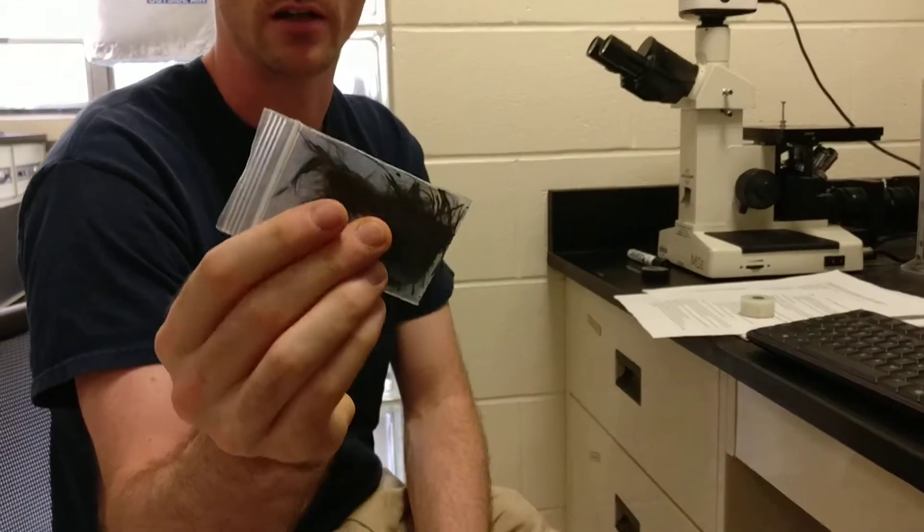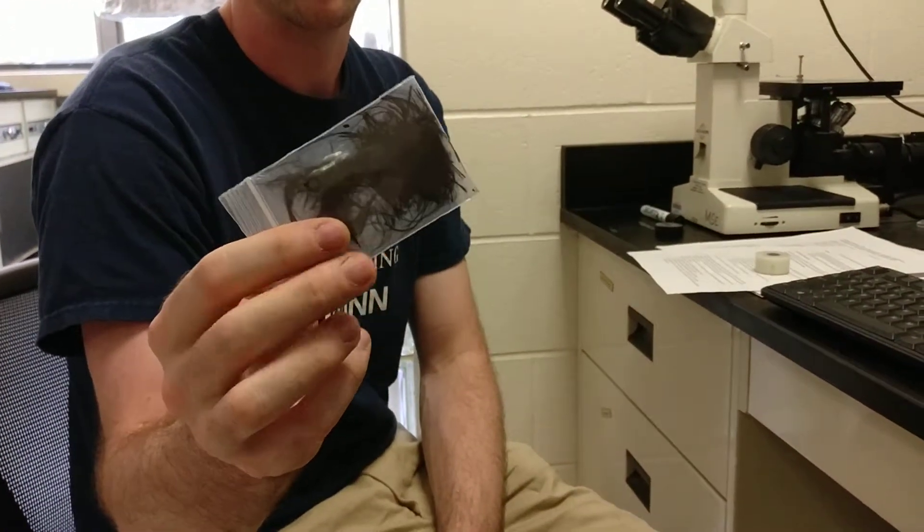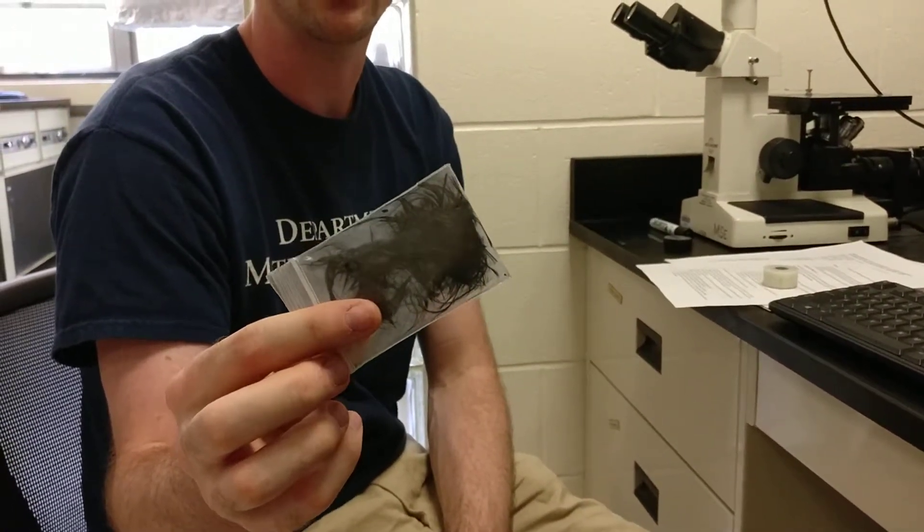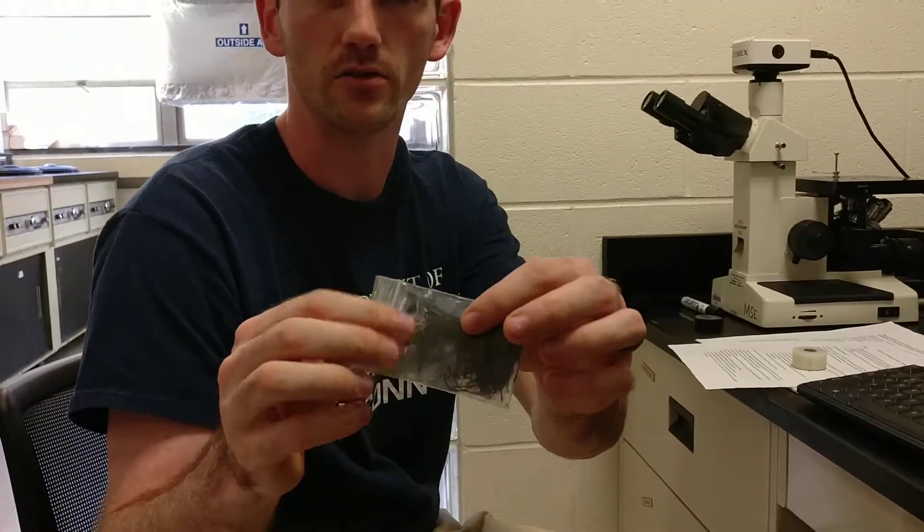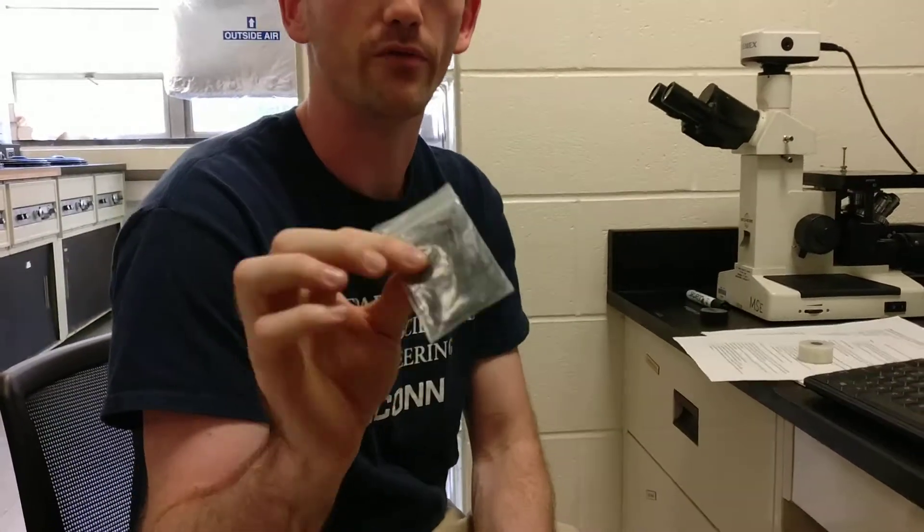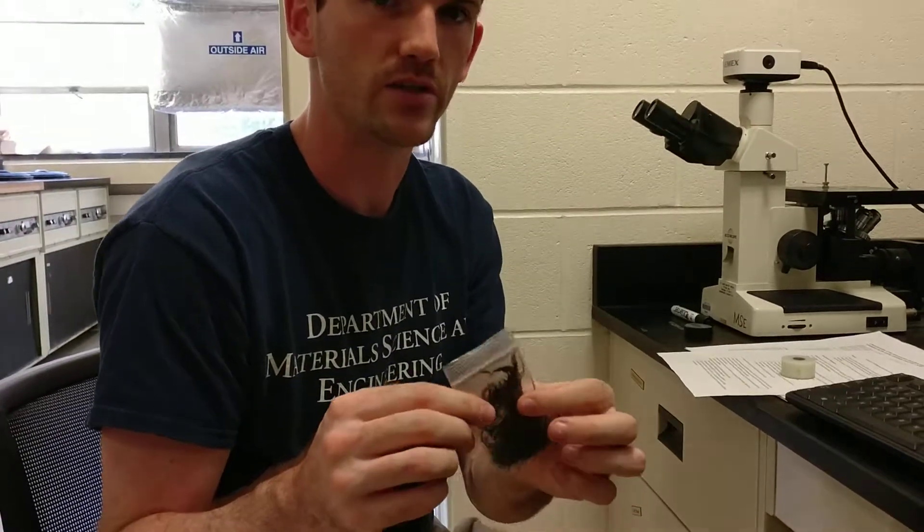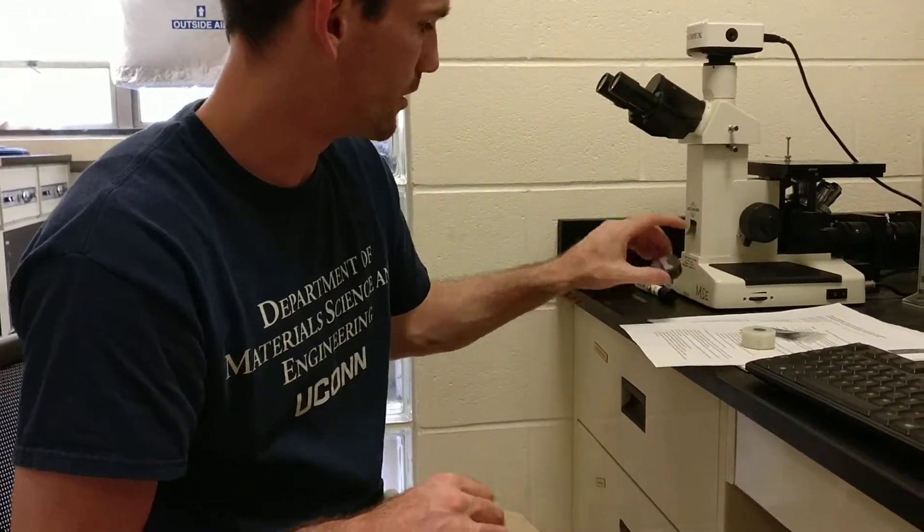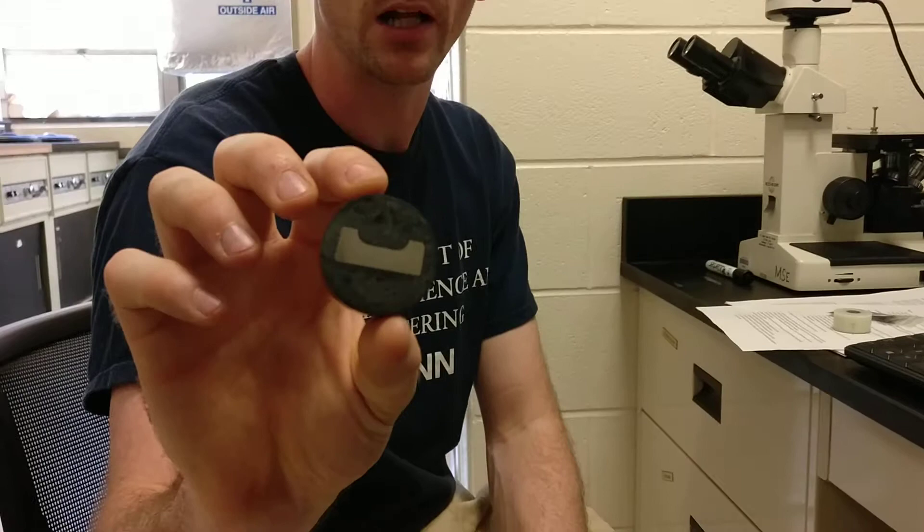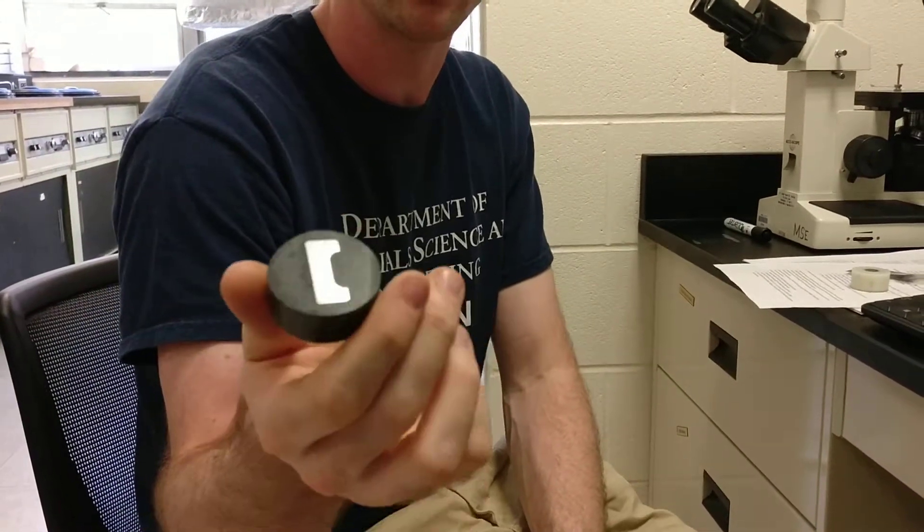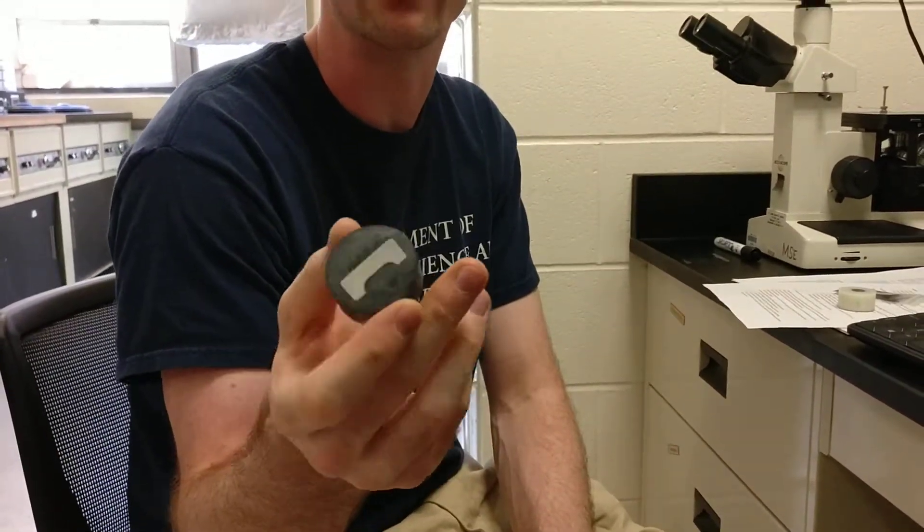These are actually from a composite. We boiled it in sulfuric acid to dissolve the resin out so we can weigh the carbon fibers and get a weight percentage. The third sample is a superalloy that has been etched so we can see the grains and different phases on the inside.